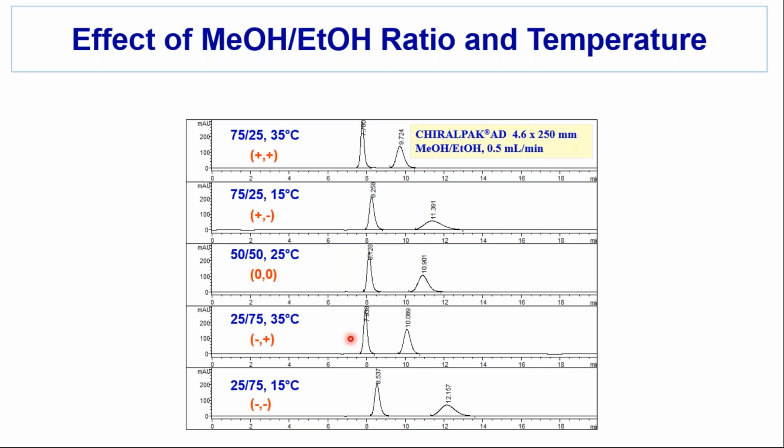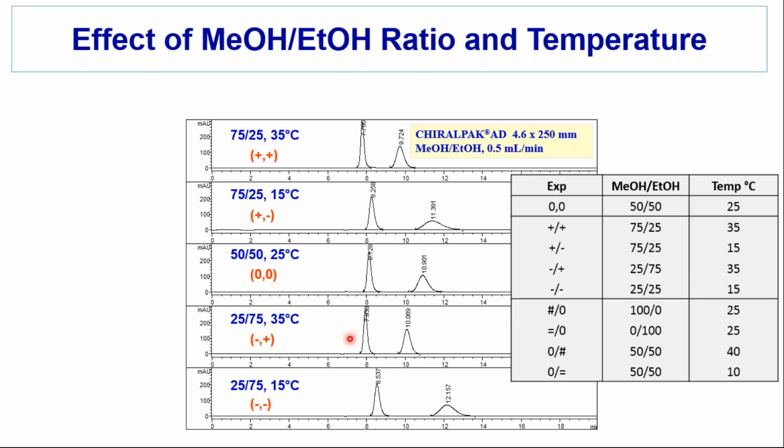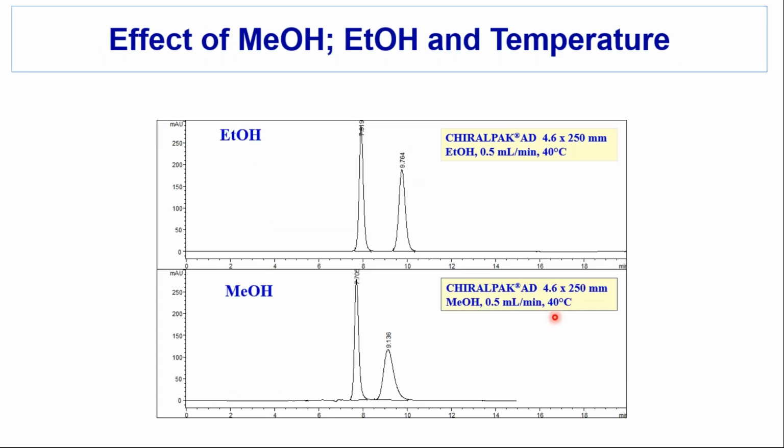So why don't we just go to straight alcohol, and why don't we go to high temperature? That's pretty obvious from this series of experiments. This was 5 experiments to come to that conclusion. We didn't actually need to run all these star points or main effect points. I knew that I wanted to use alcohols at the upper column temperature limit. And so I then just ran those experiments, got a similar retention.